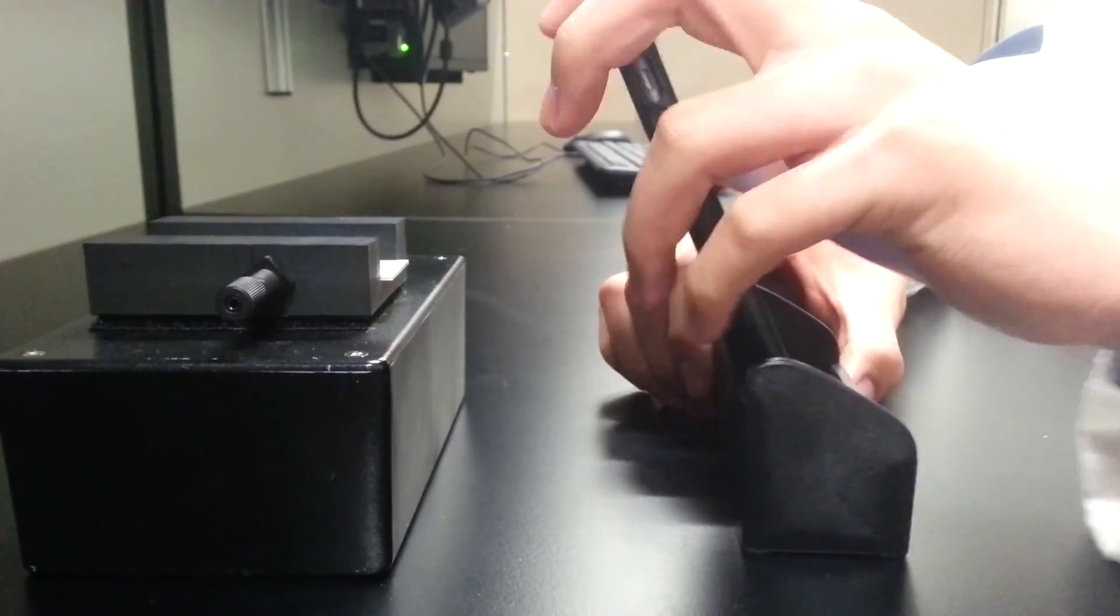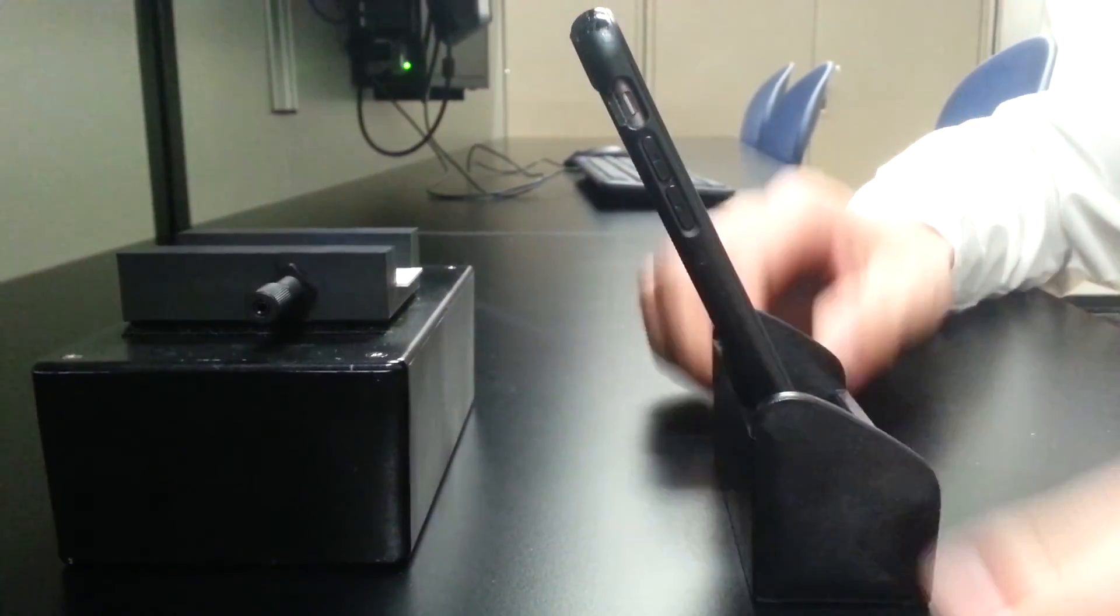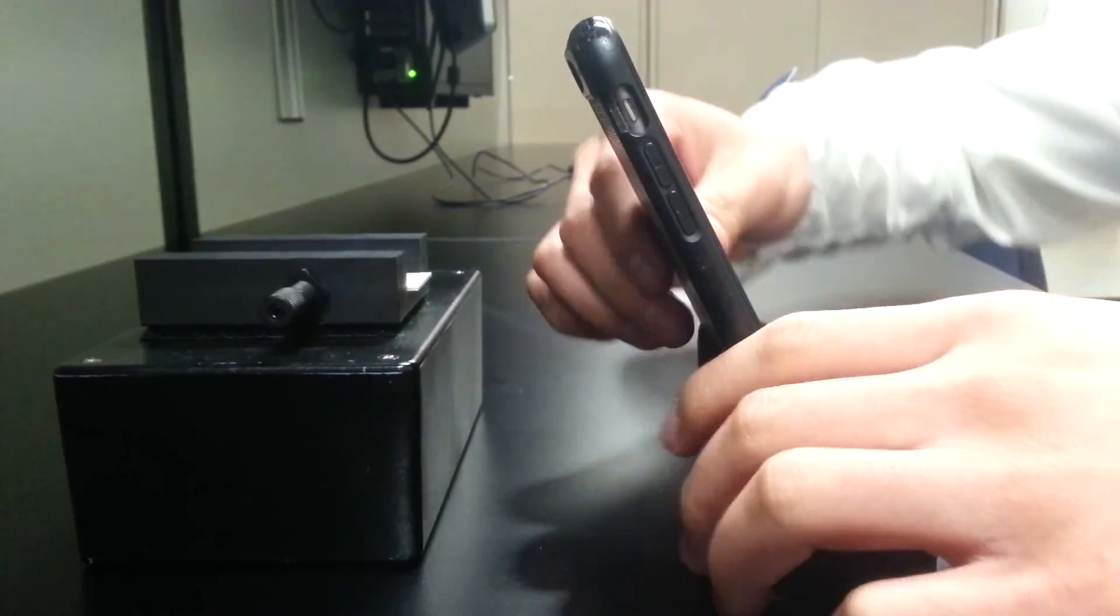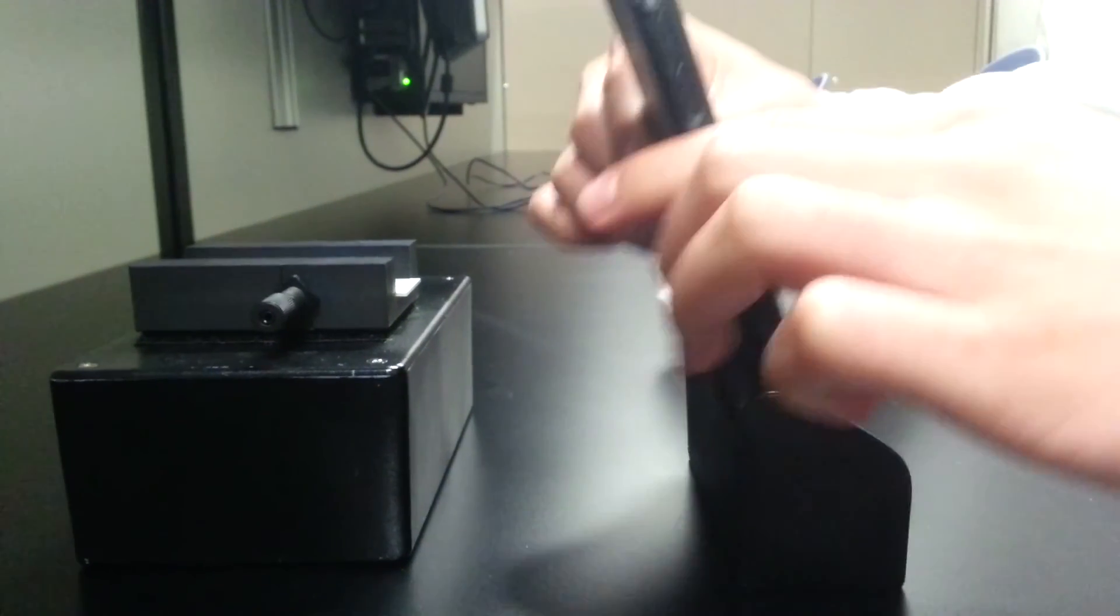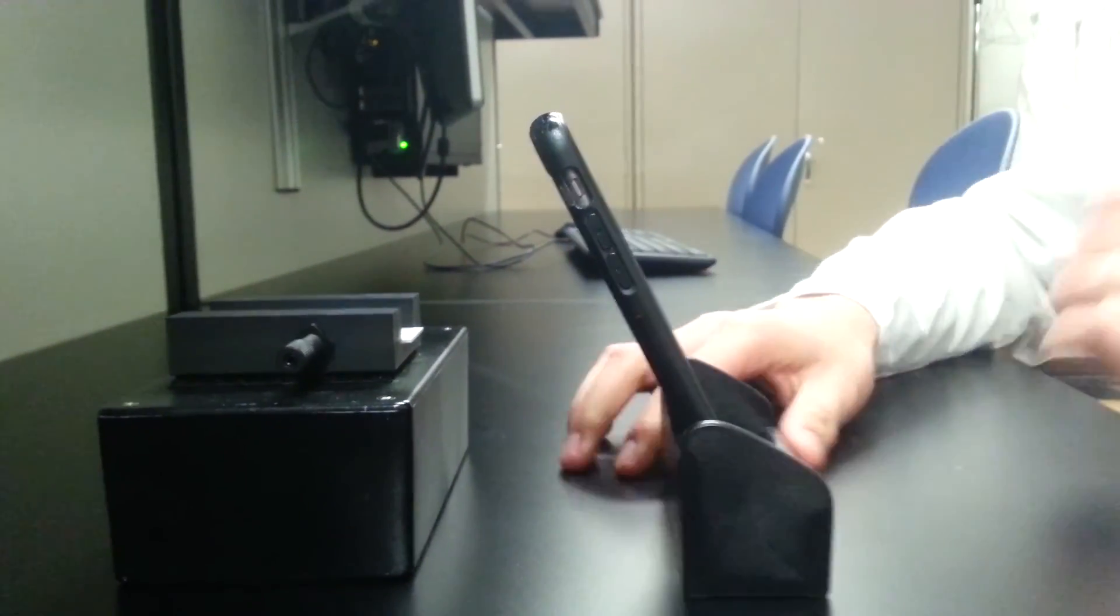Welcome back to The Nature Channel. Today we observe a wild BME-100 student attempting to use a fluorometer to analyze the results of his PCR experiment.